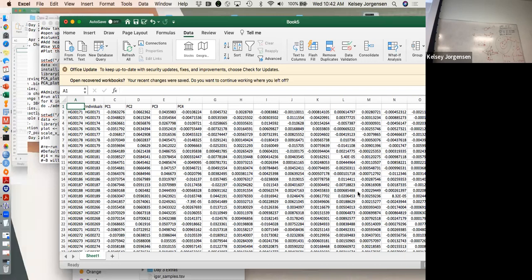So what you need to do is go to your folder and add .txt. You can change the file extension. So you can just rename and then dot. Nope, you're fine, you can leave all that. So just literally type .txt, at the end. So itembank.txt. There you go. Yep, that's fine. And then it changed it right there.